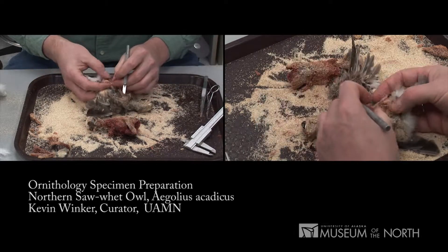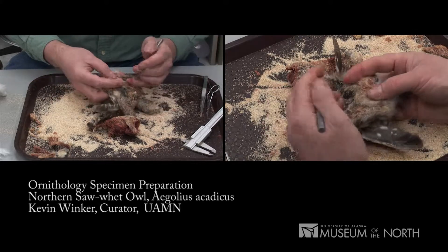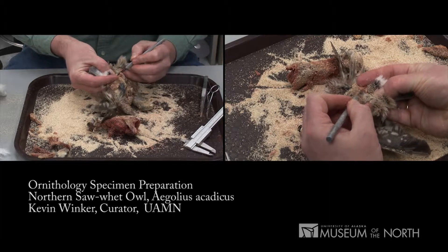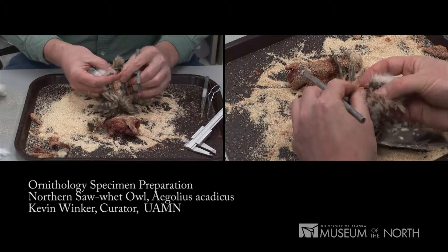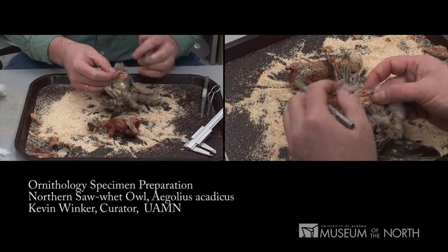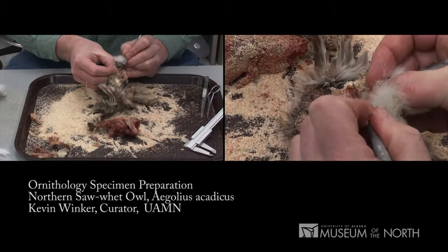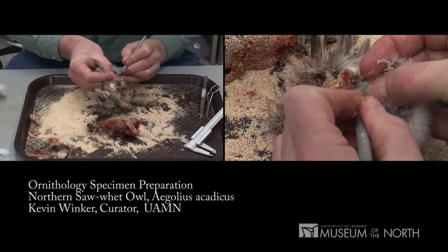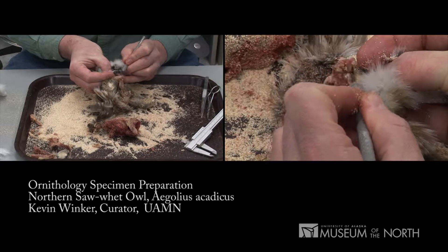There's just a little bit of fat, but we're going to get it off. Fat causes the skin to deteriorate with time and you really do want to get as much of it out of there as you can. It becomes acidic and makes the skin brittle. It can also seep out onto the label and make it illegible, especially if you don't use a proper ink. I'm scraping away right where the cloaca comes out, carefully removing all of the tissue.